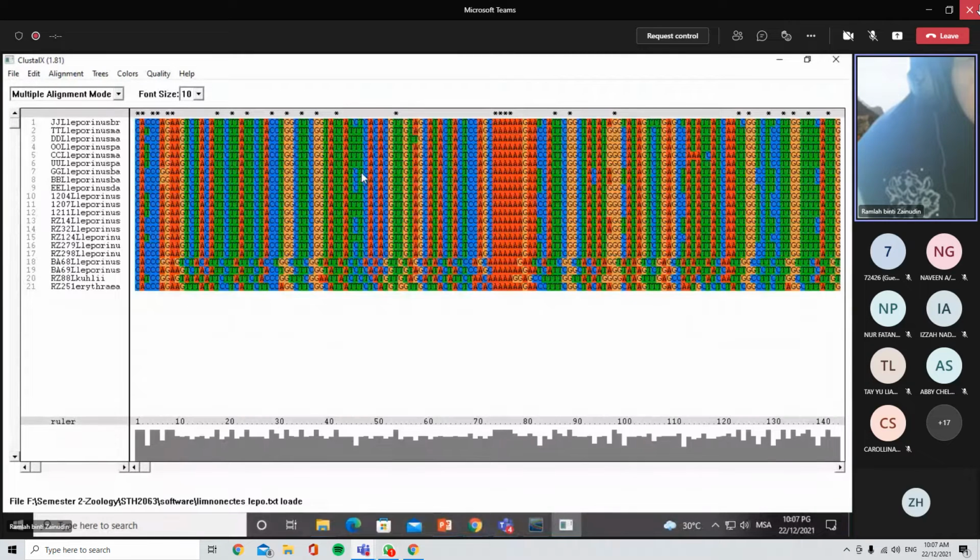Okay, so the first one you dah buat, which is check your sequence by eye in Chromas, and then you put into a notepad to prepare for the subsequent analysis. Okay. So you kena load sequence in the text file yang dalam notepad. Kalau you pakai dalam Word, mana tak dibaca. Dia can only read from the notepad. Kalau dalam Apple, dia boleh baca dalam text edit, okay, ataupun Wordpad. Kalau computer Apple is text edit.